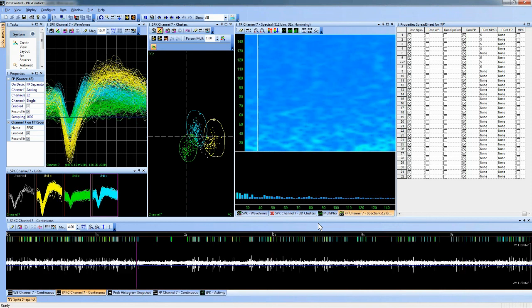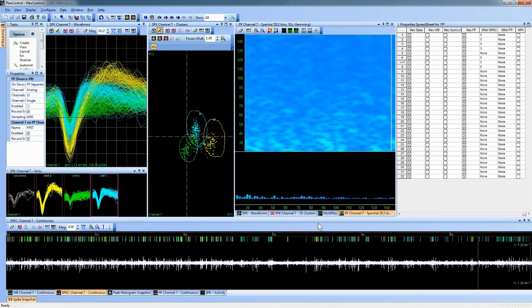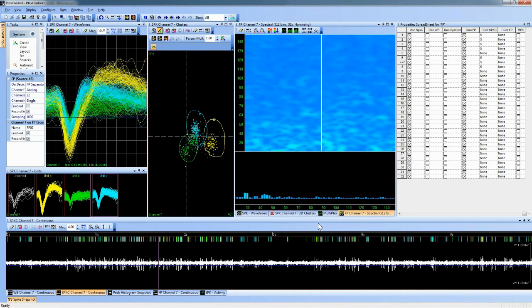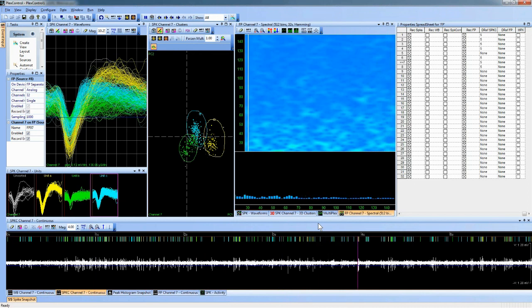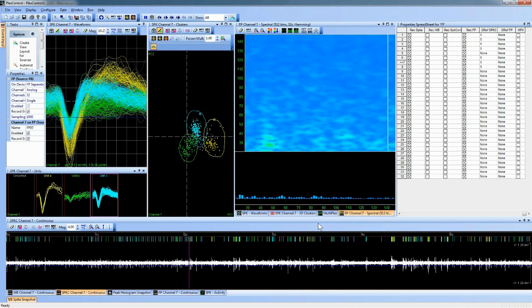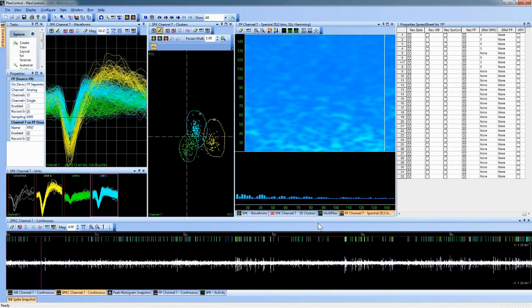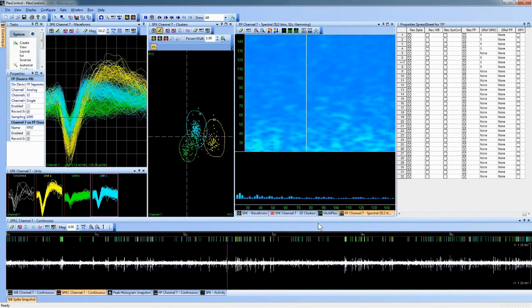Another way around that, maybe a better way, would be to also record the wideband along with any channels that you're interested in. So if you've got 4, 5, 6 channels of your array that you're really interested in, record the wideband data for those channels. The reason for that is the digital referencing that you're doing does not apply to the wideband data.